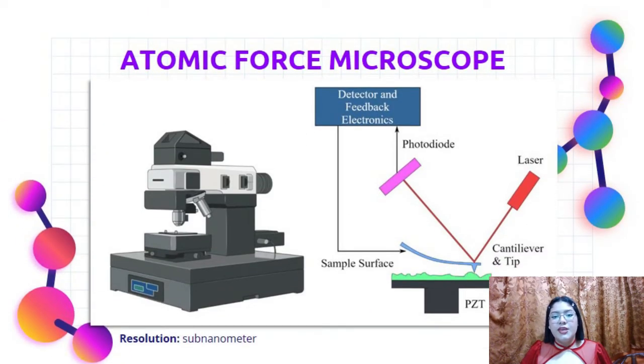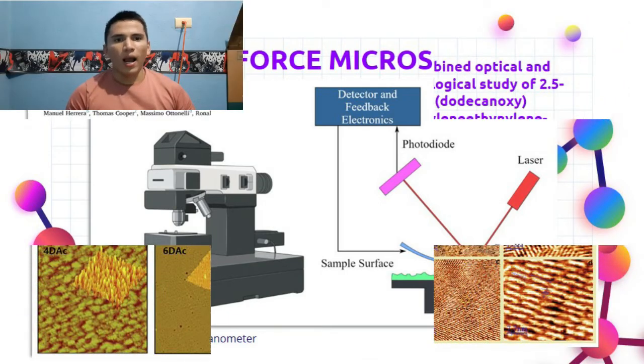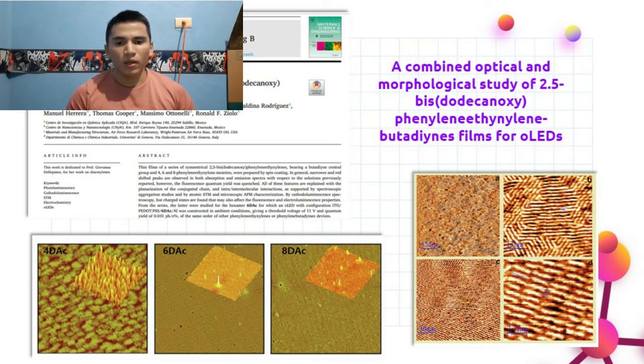Atomic force microscopy is based on mechanical detection of the surface with a very fine tip and is used for imaging and spectroscopic analysis of a variety of surface properties at nanometer resolution. This type of microscopy can achieve sub-nanometer resolution, making it an instrument capable of allowing the quantitative study of the three-dimensional structure of the surface and its magnetic, mechanical, electronic, and chemical properties. Applications.